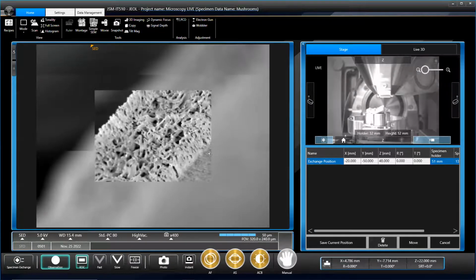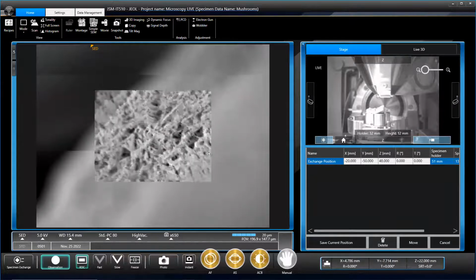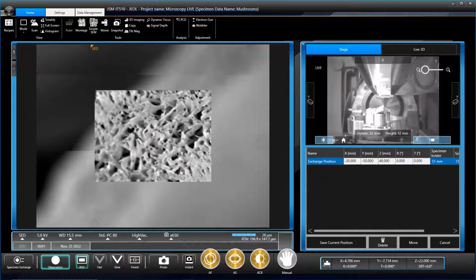We have two focusing options. We can do it either fine focus or coarse focus. So if, like Jess was finding there, it's actually really hard to tell what's getting better or worse, you can put it in coarse and just sort of shift through the focus quite quickly, and then you can do all the fine details afterwards.